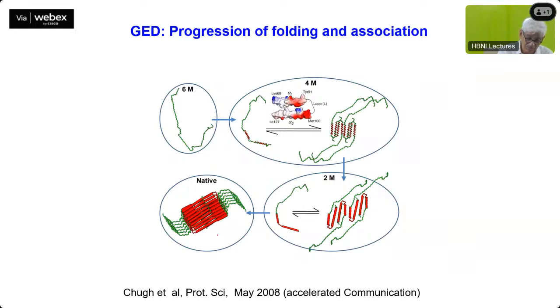See this one rope, this red one is increasing. This is forming the helices that are packed in the middle, and you have these terminal loops which are hanging around. So these are flexible, and these are the peaks which you are seeing. And what is the role of this? These ones actually wrap around the neck of this budding vesicle, and this is the core of that rope which is getting formed. This is all full of these helices and forms a large assembly.